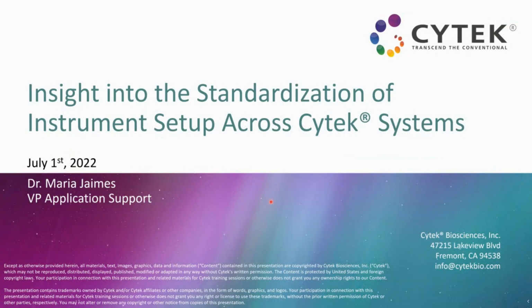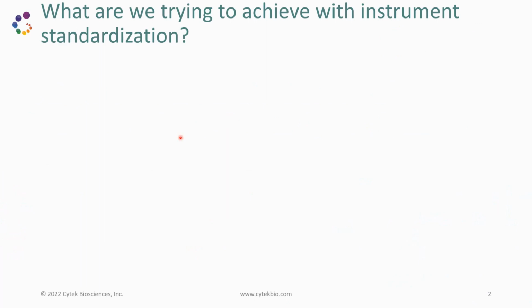So hello again, my name is Maria Jaimes, and I oversee the application support team at Cytek, and I'm very excited today to be talking about standardization of instruments across Cytek instruments. It's been a question that has been asked very frequently in the last few months, and we thought it would be good to have a discussion and to share with you all the information that we have about this fascinating topic. So let's get to the meat.